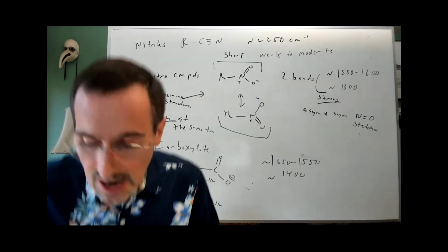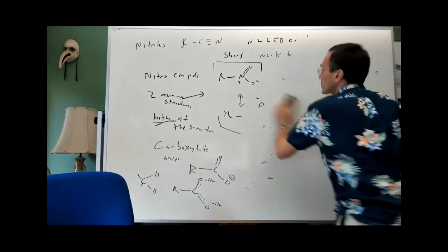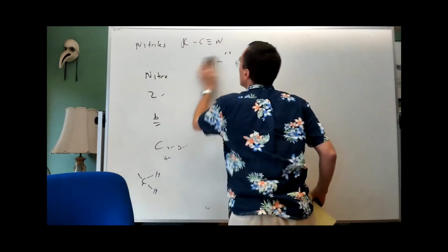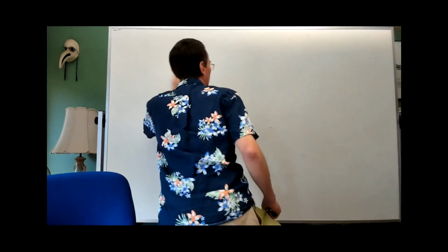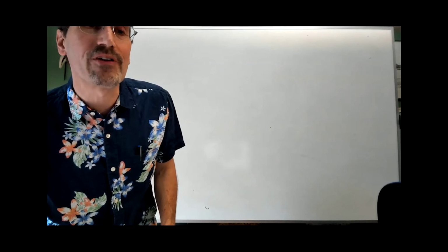All right, I want to wrap up today with a couple more comments, and that should set you up pretty well to get everything reinforced with the homework. So the IR spectrum, or IR spectroscopy, is useful for many, many different functional groups.